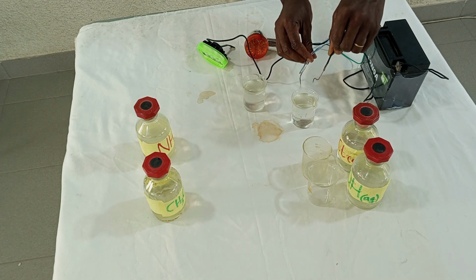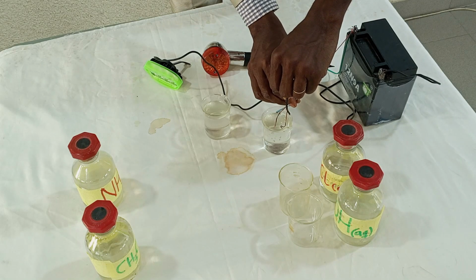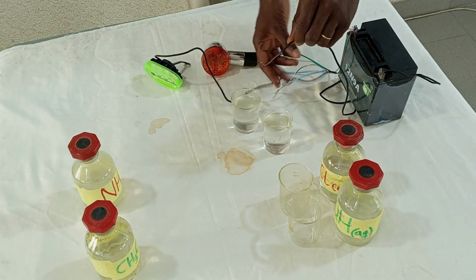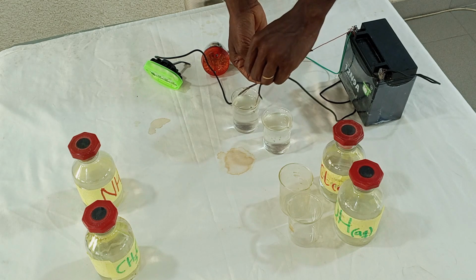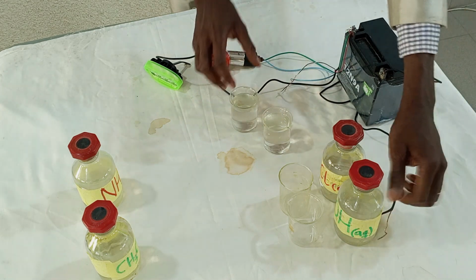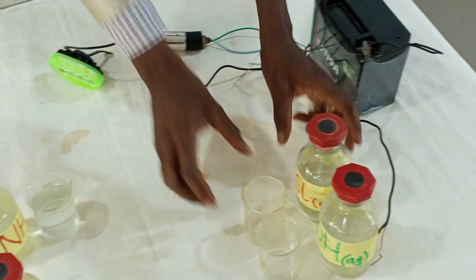Now let's see what happens when I do it for the ethanoic acid. So the lamp didn't produce any light. Now let's consider the ammonia too. The same thing happened, no light. Okay. Now I'm going to do this demonstration for the strong acid and the strong base.